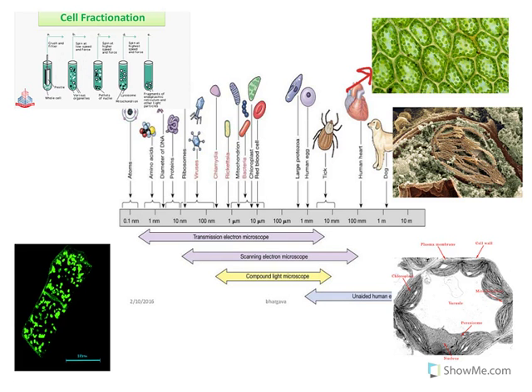So remember, when we're looking at microbiology, everything that is being told to you in your textbook and any picture you see had to be figured out by somebody. So the question you should be asking is, how did they figure that out? And the first step is through different types of microscopy.